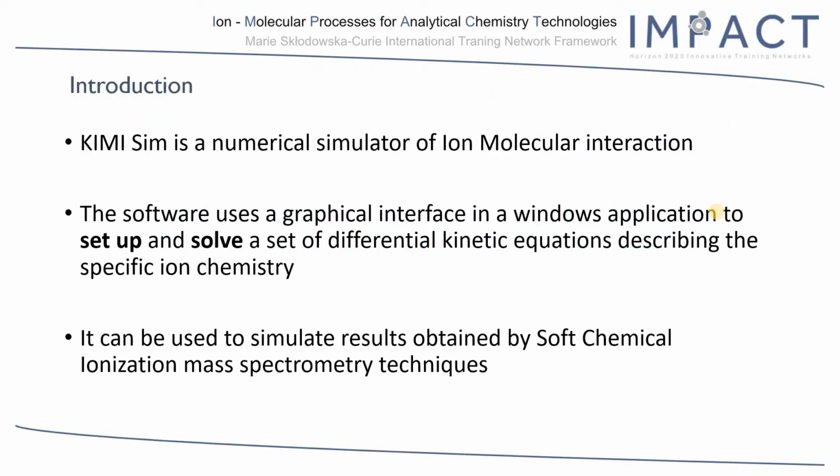KIMI is a Windows-based application that allows you to simply draft a set of ion molecular reactions into a graphical interface. The set of reactions is then automatically transferred into a set of differential equations and numerically solved using the classical Runge-Kutta algorithm. The simulator was built to support experimental results from soft chemical ionization techniques, but can be also used to simulate other problems related to ion chemistry.